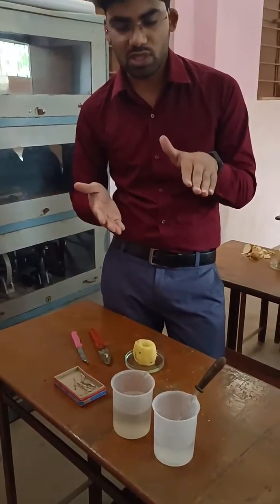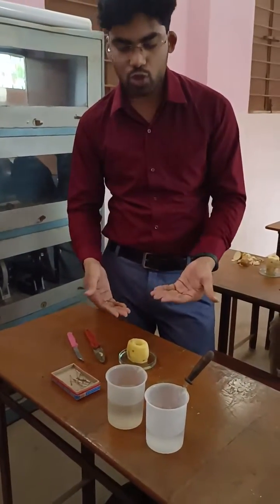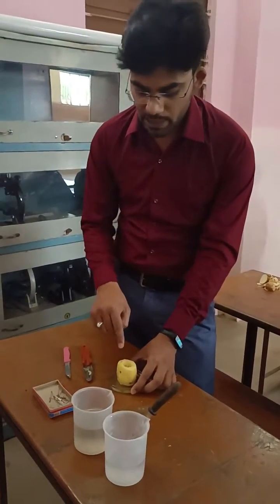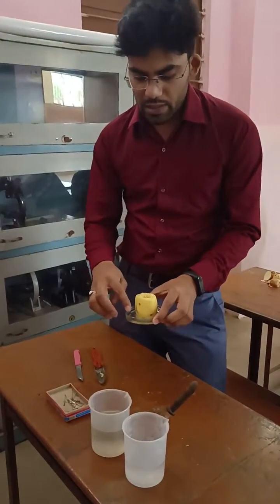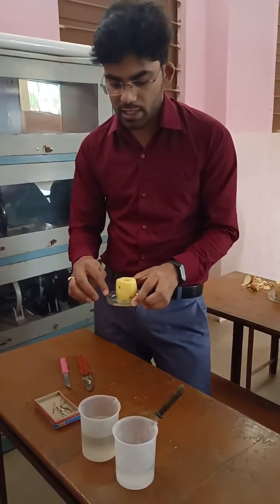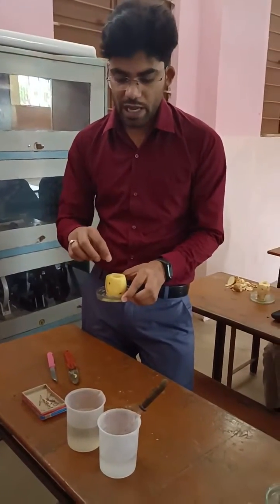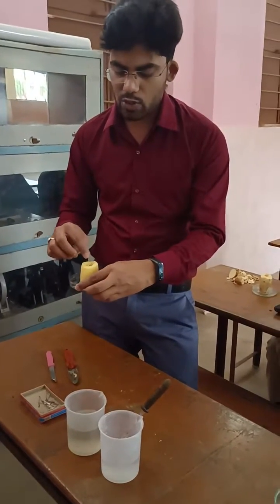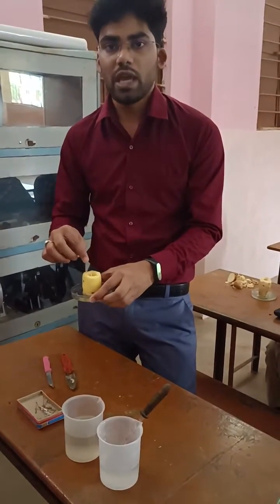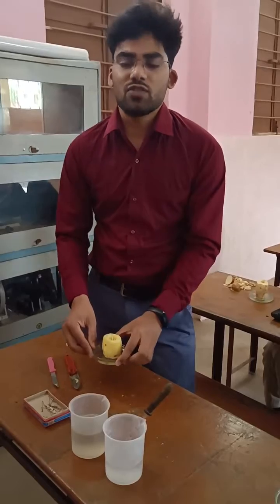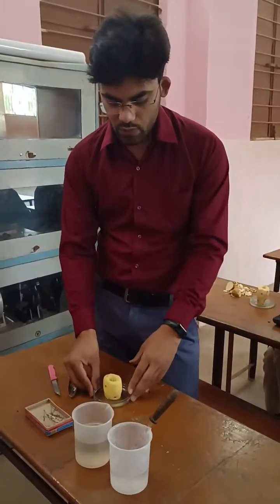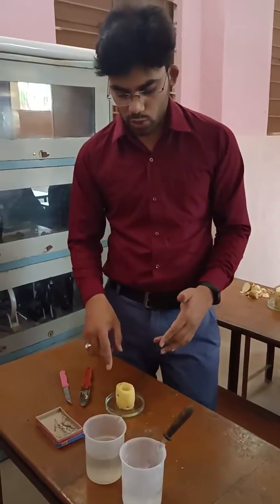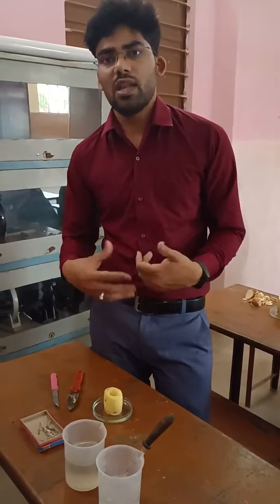For this activity, first of all we have to peel the potato and then we are going to cut the potato from both sides in order to make it flat. Later on we are going to make a cavity in it. In this petri dish we have filled water, and in this cavity we have filled the sugar solution. We are going to mark the level of the sugar solution with the help of an all-pin. Later on, after 15 to 30 minutes, we will notice that the level of the sugar solution in this potato cavity will rise.